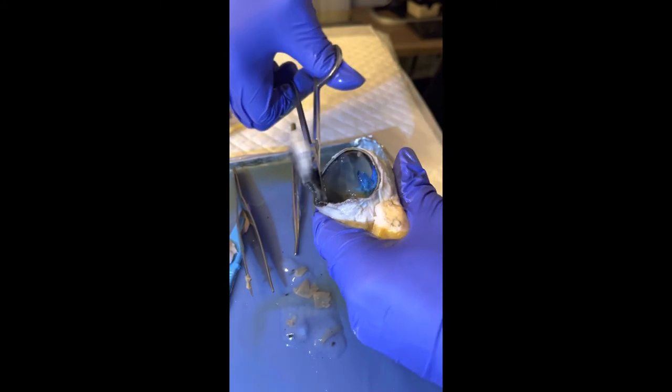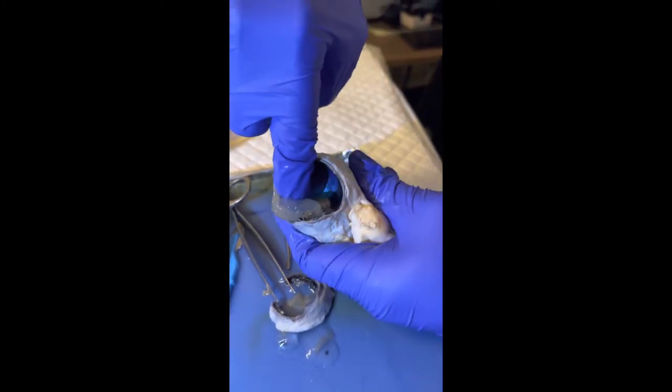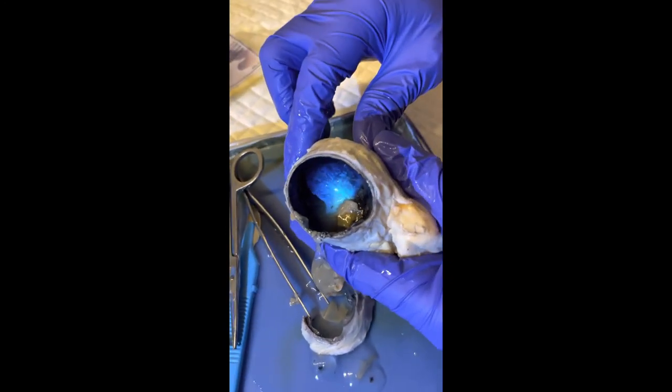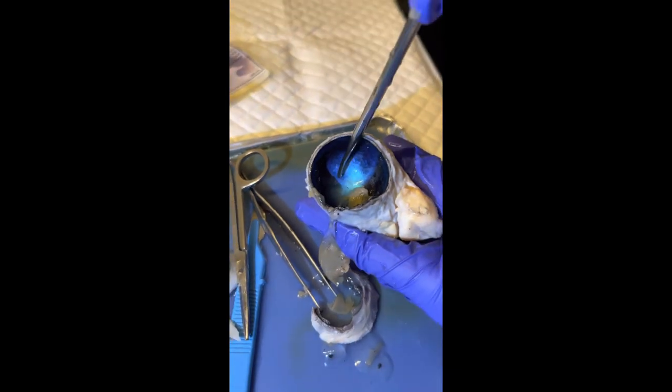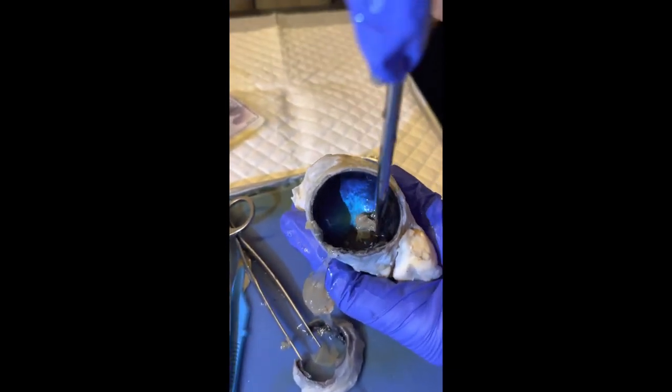Lastly, underneath the retina and the optic nerve attachment is an iridescent-like film coating that is also attached to the choroid. This is a colorful and shiny bluish-green substance that allows the cow to see at night by reflecting the light that is absorbed through the retina.